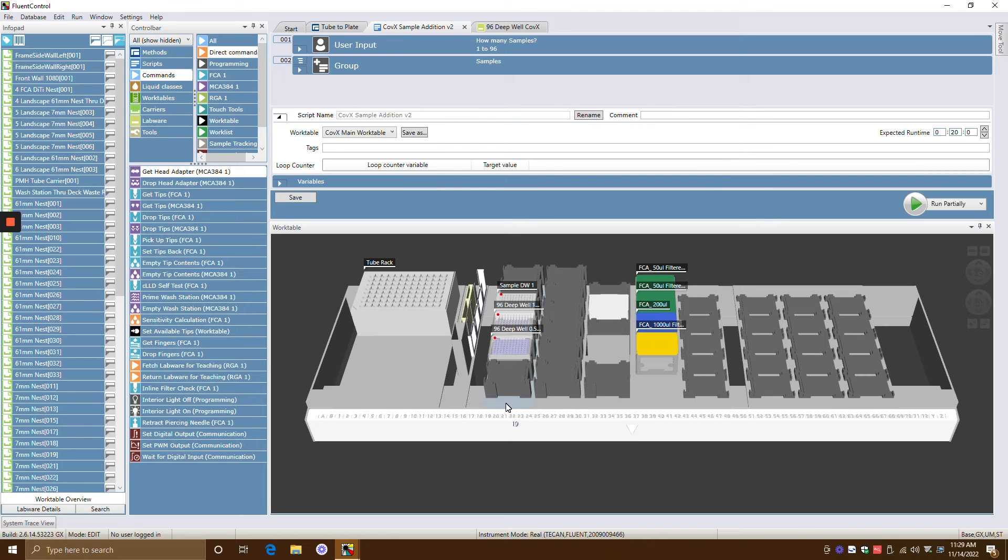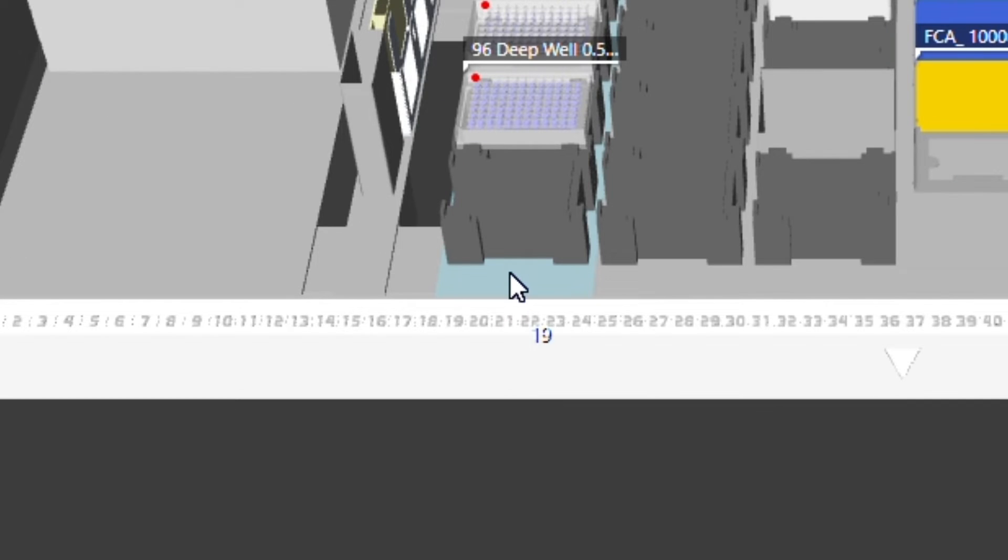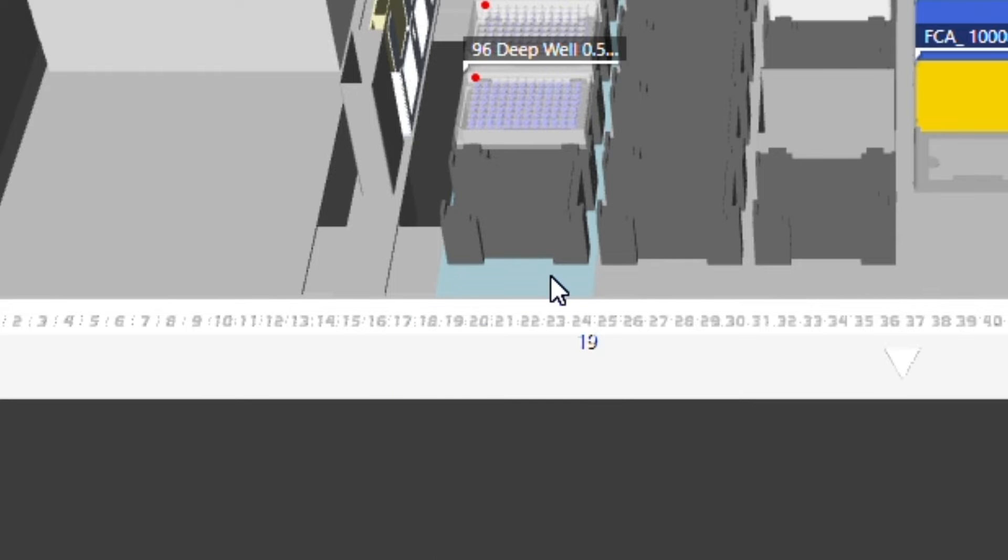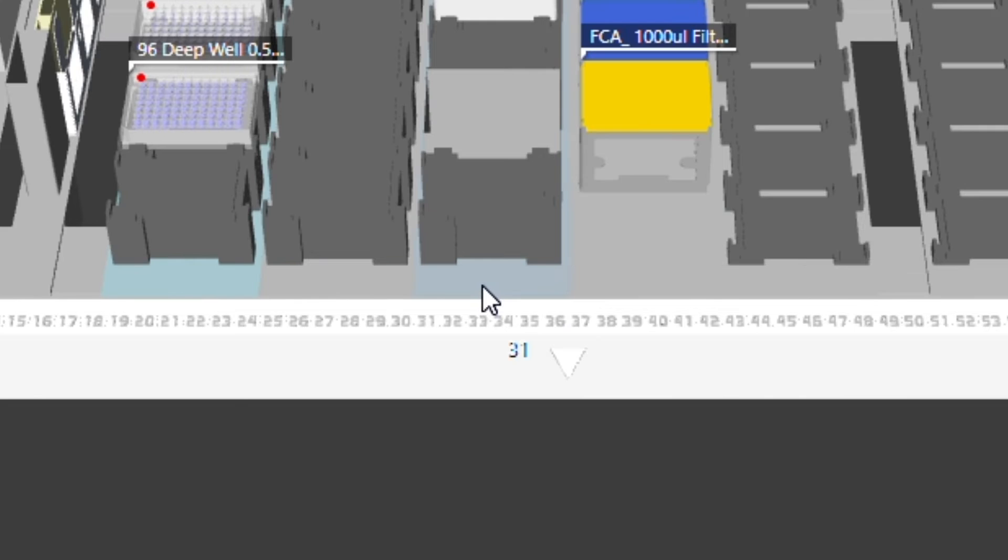The very first most left position is the position where your carrier sits. So you see this one, it covers 19 to 24, but this is going to be considered position 19. If you look at this one, this is 31 to 36, but it's still going to be considered position 31.